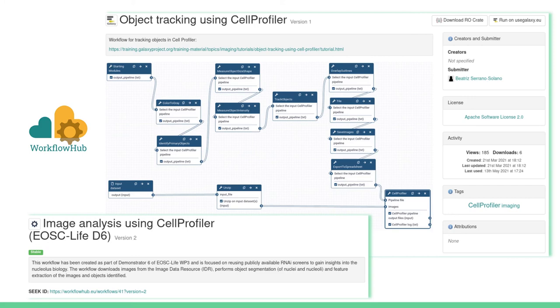The workflow is public and available for everyone in the workflow hub, together with another one we recently developed on object tracking using CellProfiler too. Those workflows can be run directly on usegalaxy.eu through the button you see on the top right side of the screenshot.